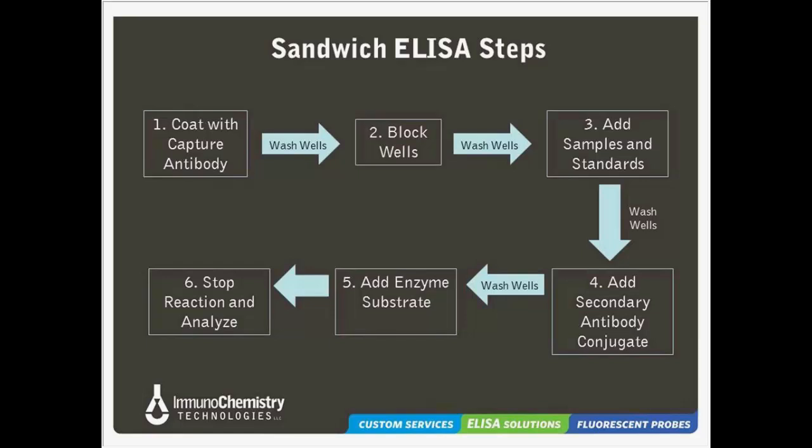All right. We thought we'd just put in a basic, stereotypical flow chart on how you do an antibody sandwich assay. You coat your plate, you better block it, and then you wash, and then you capture your sample, whatever that may be, or your standards.